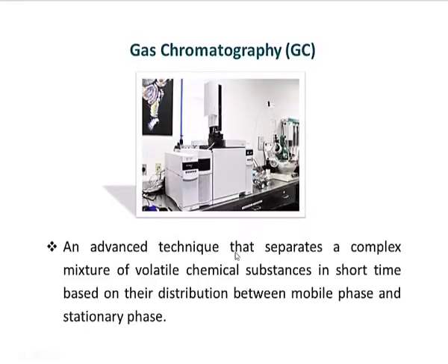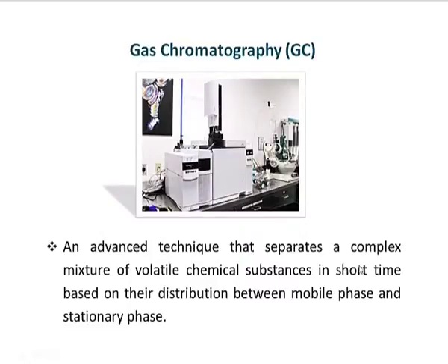Now, there are certain very important key terms which I would like to draw your attention towards. The first term is that it's an advanced methodology. So, it's a better method than what we have learned so far about TLC, column chromatography and paper chromatography. It's better because it is able to separate many more solutes than could be achieved in all those methods. And it is also able to do that in a very short time, which could range from some minutes to, let's say, 1 hour or so.